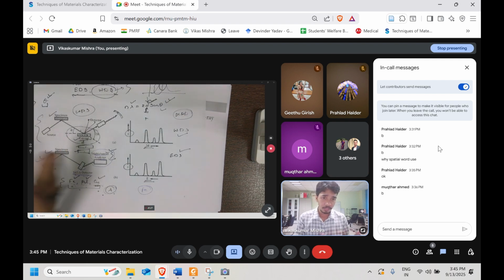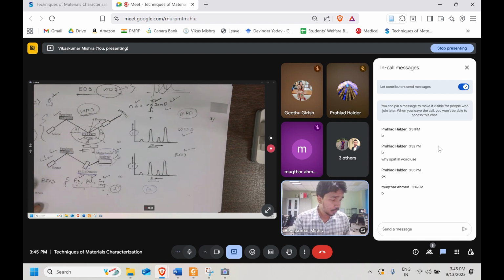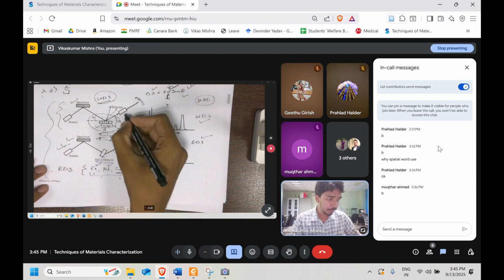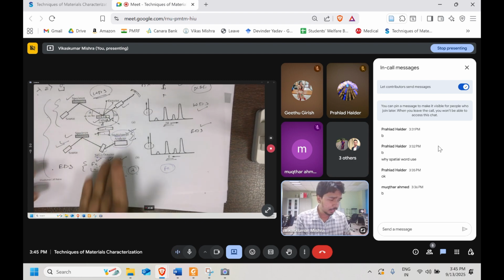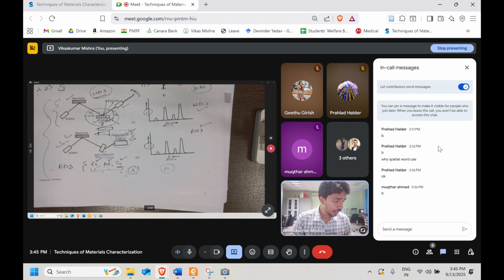So you have multiple, 3 to 4, crystals in the WDS, which you can use. Okay. So the multiple detector which we are talking about, these crystals which we are talking about, the detector remains the same. It's just that this particular crystal will differ. So here we are using multiple, and here we are not using any crystals at all. Okay. So this was the thing.